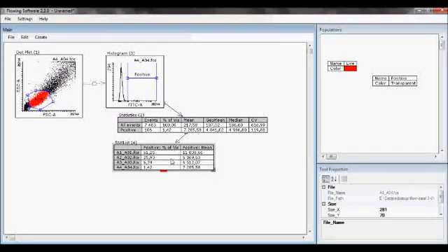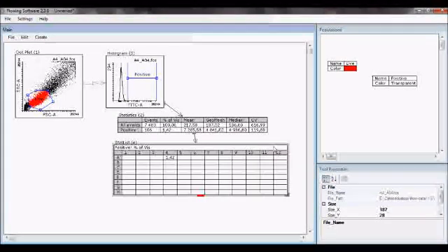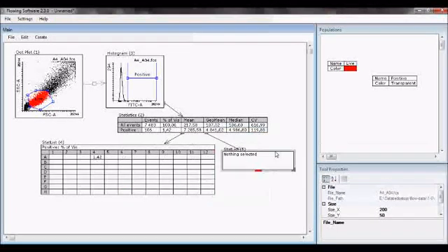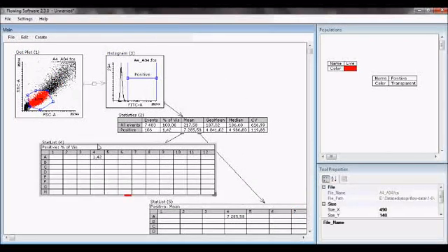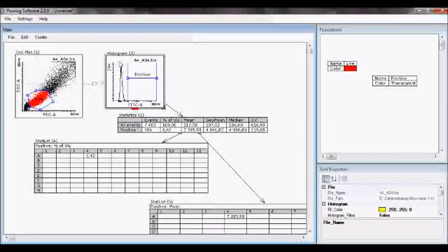And then this can also be visualized as a 96-well. In 96-well mode you cannot show more than one number, but nothing prevents you from creating several stat lists. Here we can select the mean and show it in 96-well mode. They are here. And this 96-well mode works only if the data file contains the information from which well it has been run.